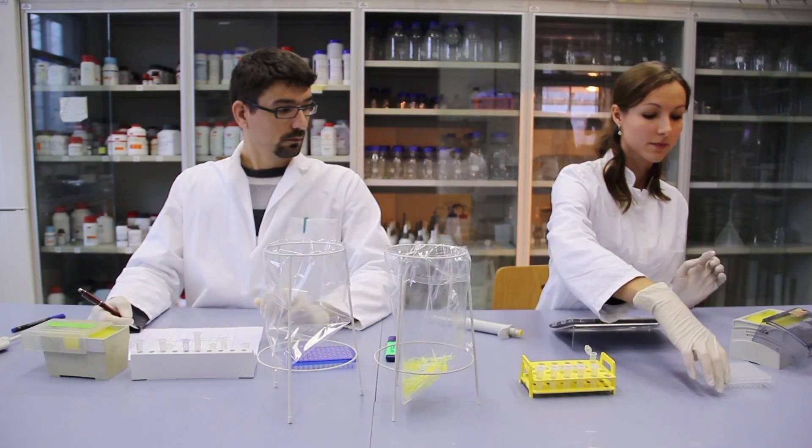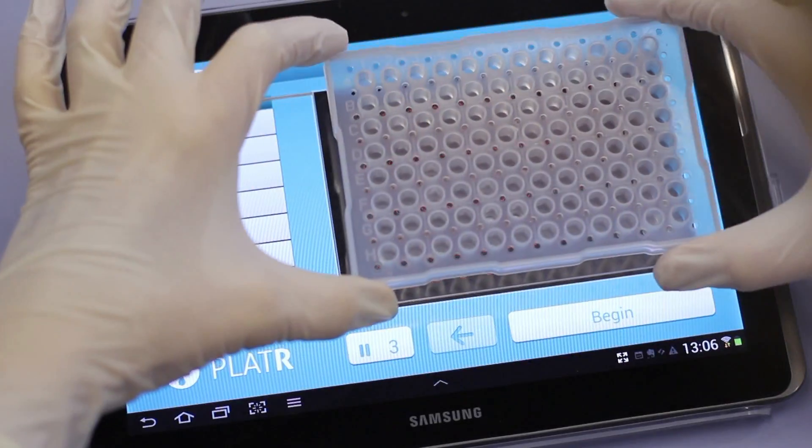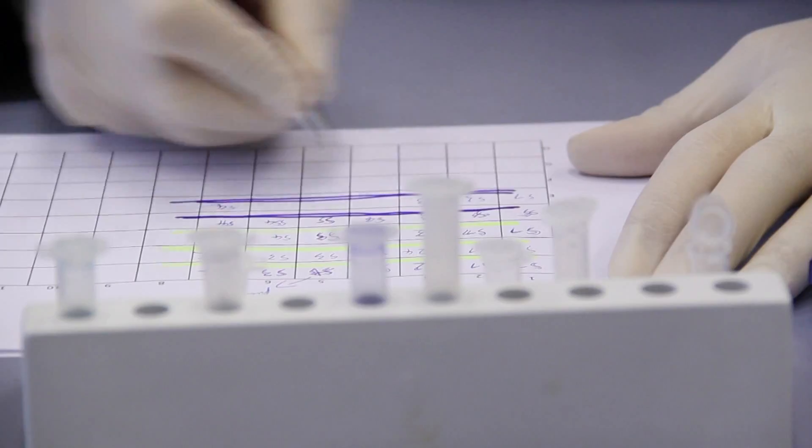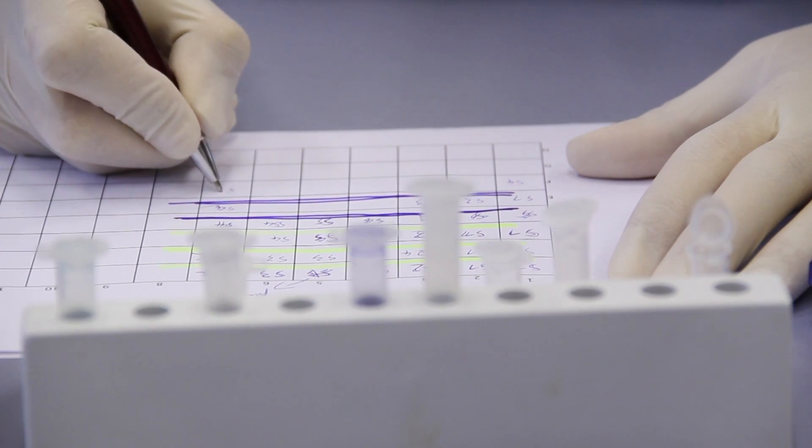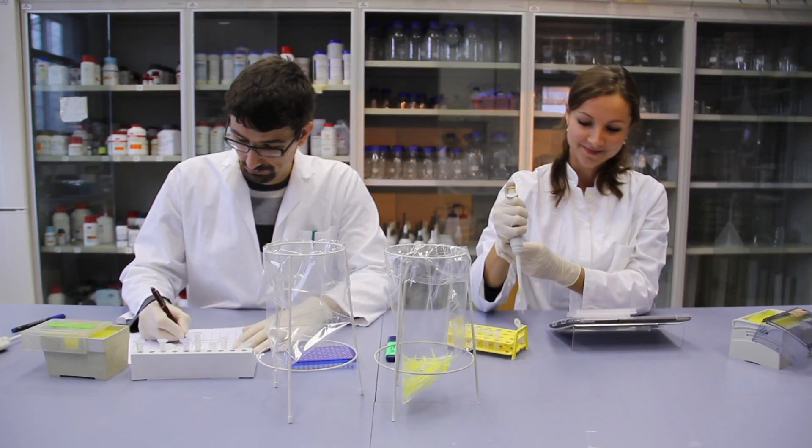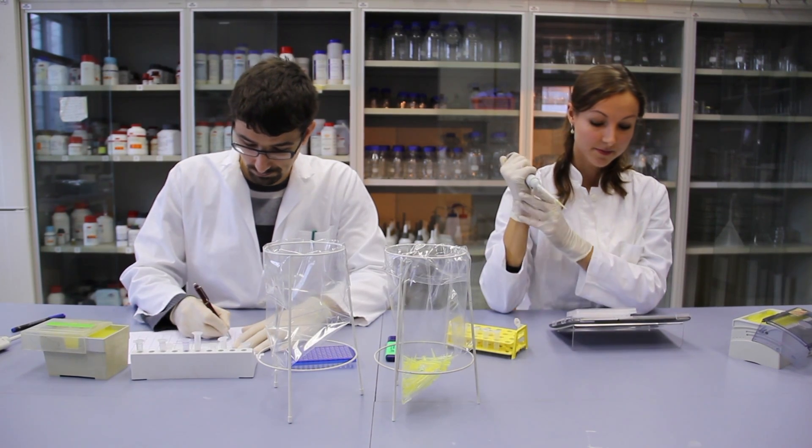Just attach the plate holder and the plate will fit snugly onto it. Platter can support 96-well and 384-well plates. With Platter, there is no more need to create pipetting plans on paper. Everything is faster, simpler, and better organized.